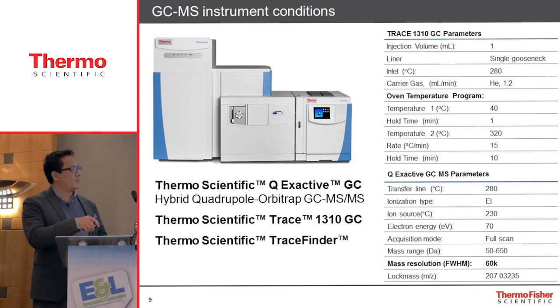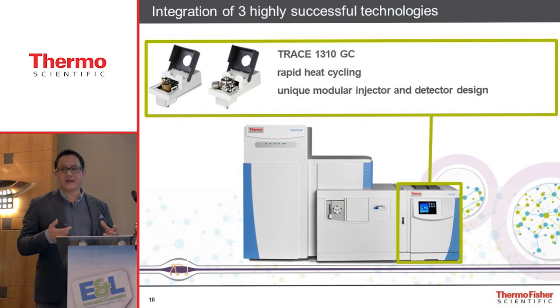I would say we operated the system up at 60,000 resolution, so this is a resolution that really can't be matched from any other technology on the market. But the system itself can go faster than that and at higher resolution than that. And then we process the data in a new automated data processing software.